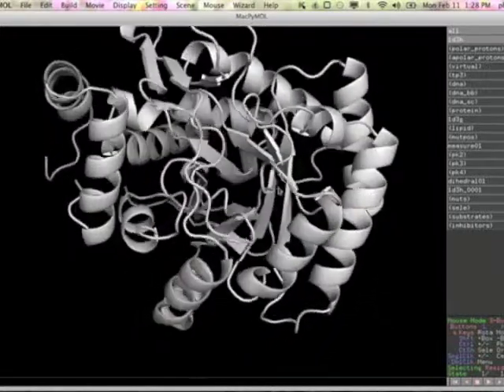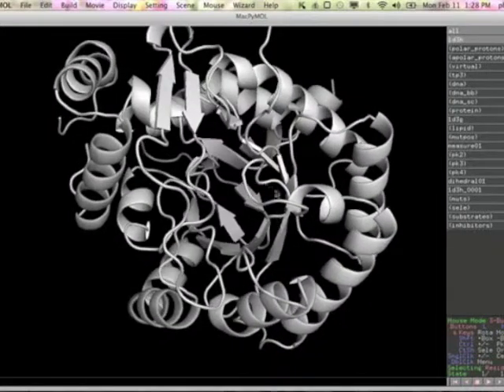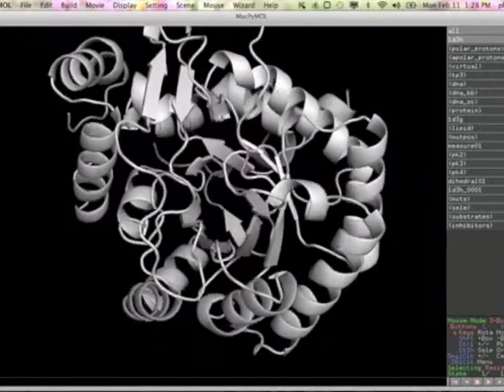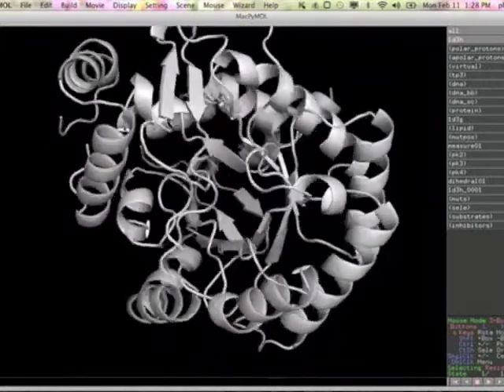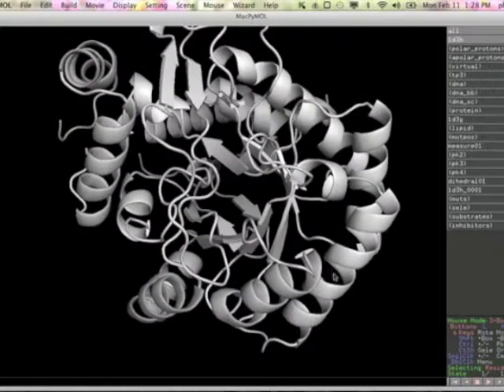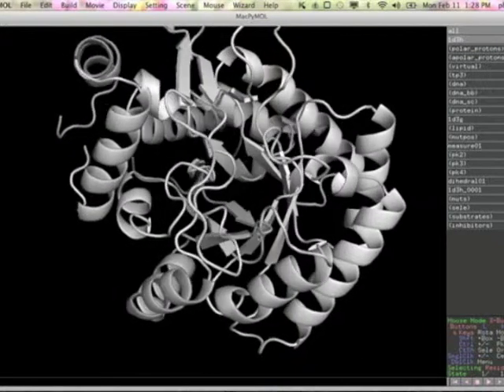In fact, this is a really beautiful protein structure. You can see the way that the arrows, the beta strands here, form the middle. In fact, if you could see the way they're connected, it's almost suggestive of a barrel, and the strands are the staves of the barrel. And then we have the alpha helices around the outside. Okay, so that's a view in which we can get more sense for the way the chain moves as it goes through the protein.